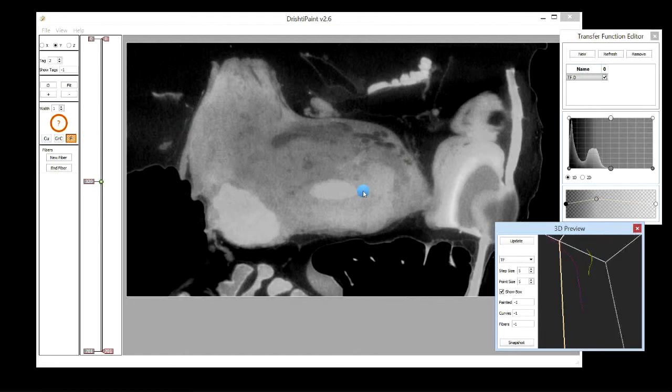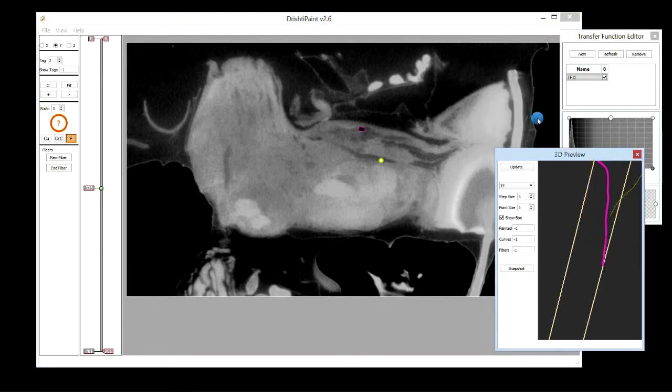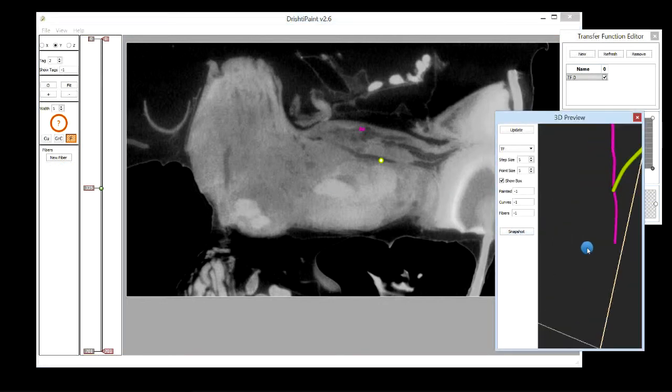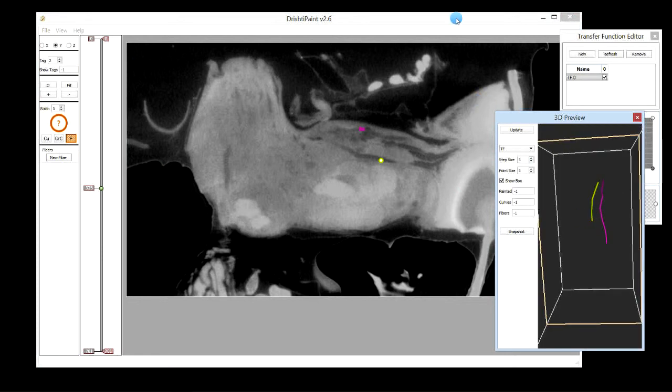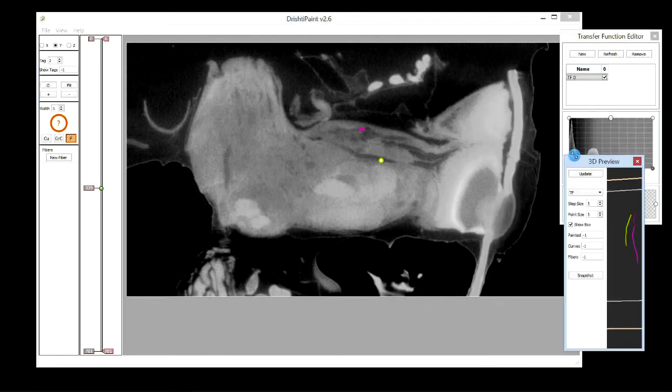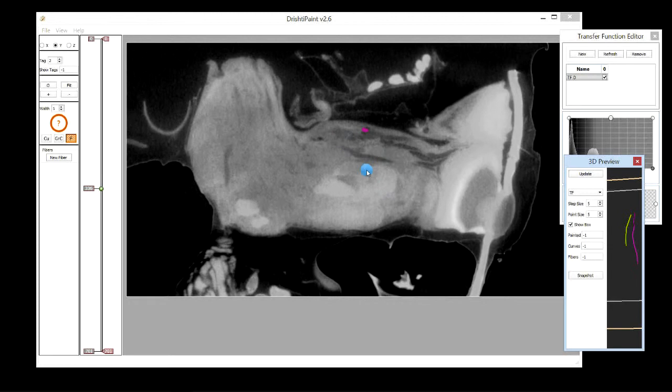And what we can also do is we can increase the thickness. So the thickness is 1. Let's give the width as 5, and then hover over that and press W to change the width. We can also change the width of this track, W, so that we can see that clearly. So let's end the fiber. So these are the two fibers that we created here. Let's create another one. Say this one here. Let's see where it leads.